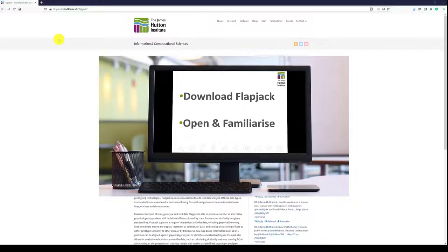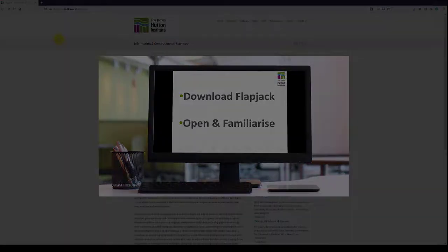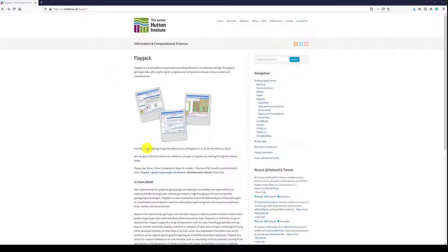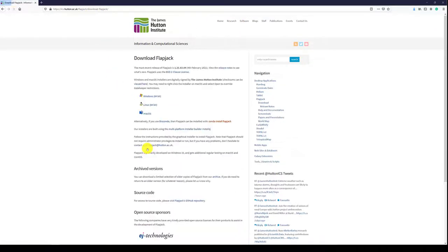opening and familiarizing ourselves with the application. Flapjack is available to download from the James Hutton Institute Information and Computer Sciences webpages.